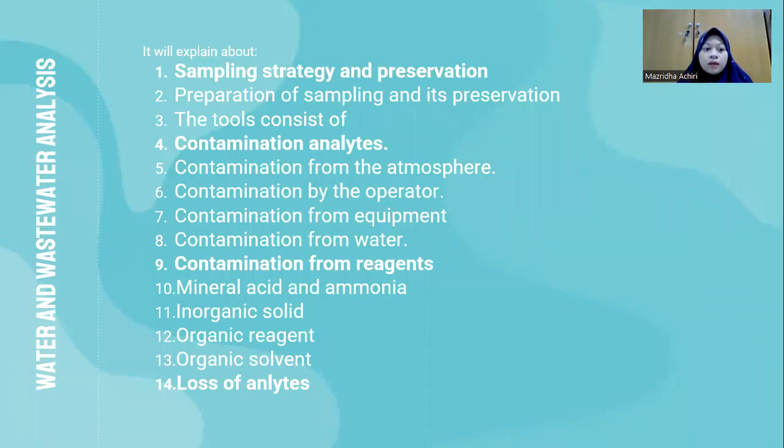Okay, water and wastewater analysis. It will explain sampling strategy and preservation. This material covers preparation of sampling and its preservation, and the tools.